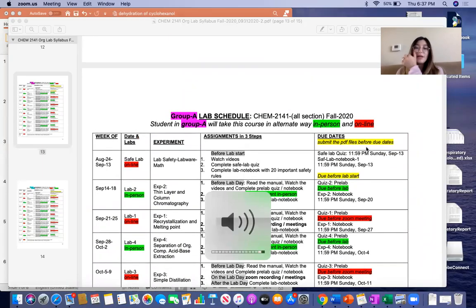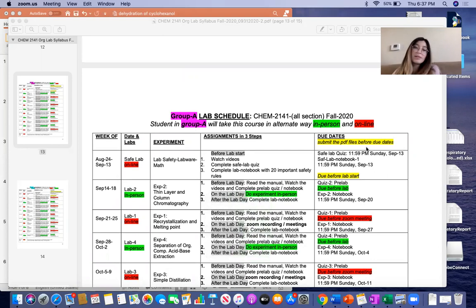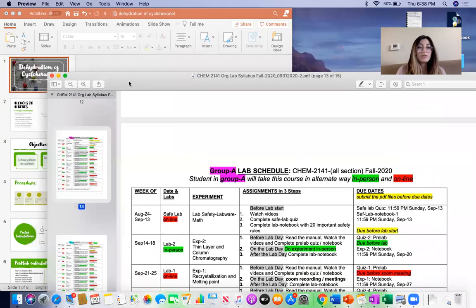Everyone, this is going to be your pre-lab lecture for experiment number 9, dehydration of cyclohexanol.